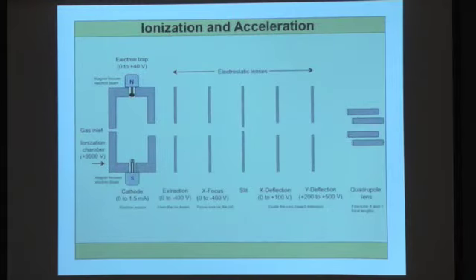Now we'll go through the instrument for the three different parts. And the first one is the source. So these are gas instruments. Now we send a gas in, it gets bombarded by electrons. This is like a little hot wire from like a light bulb.